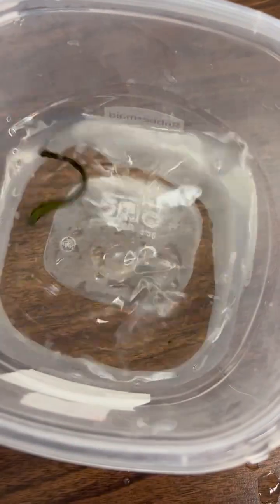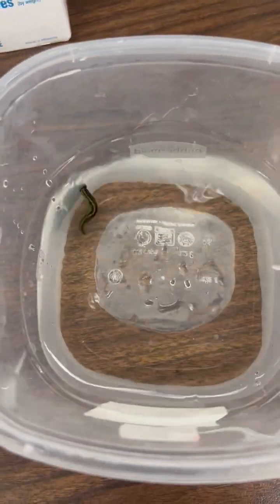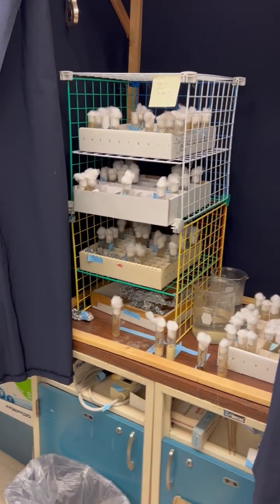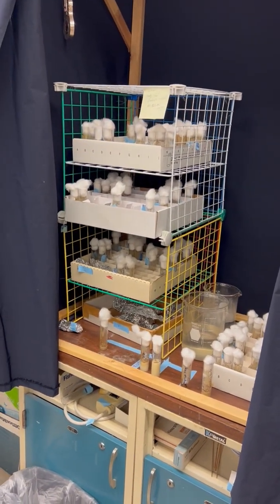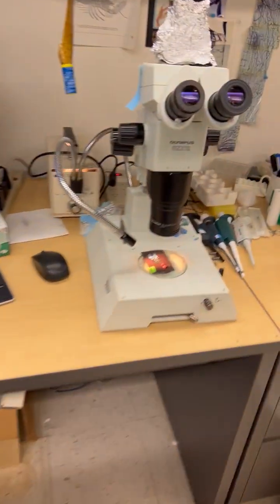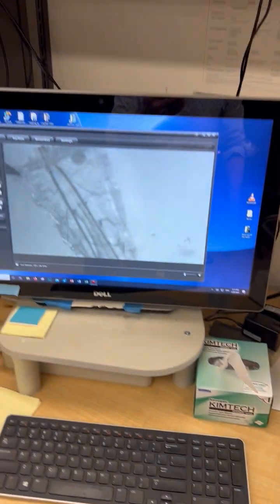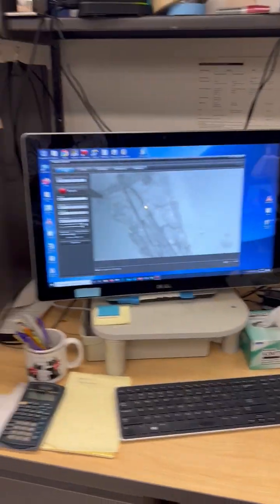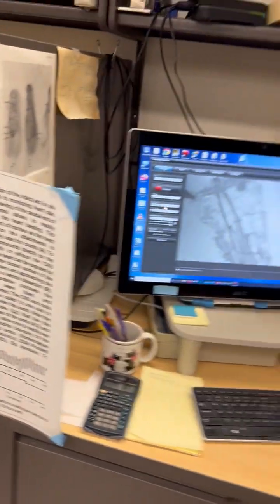And then we had our favorite animal, which nobody wanted to feed, and that was our leech, and why people use leech. So that went over kind of. And then we talked about our mutant lines that we have in flies and how you get your F1 cross, for example. And then we went over here and we showed them a live prep of the heart rate of a Drosophila and why people use the Drosophila to measure heart rates, and some preparations over here.